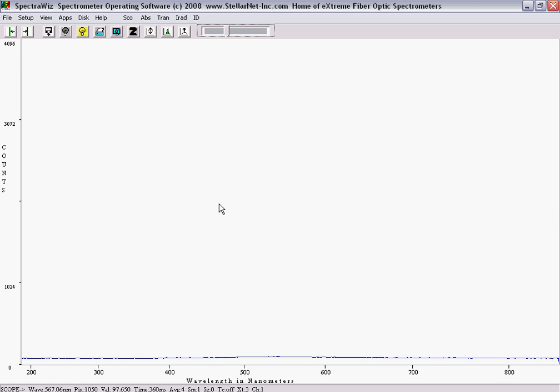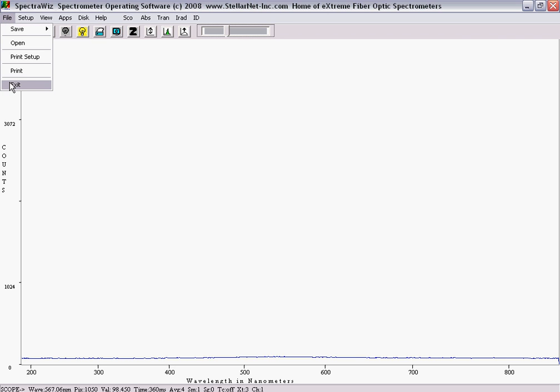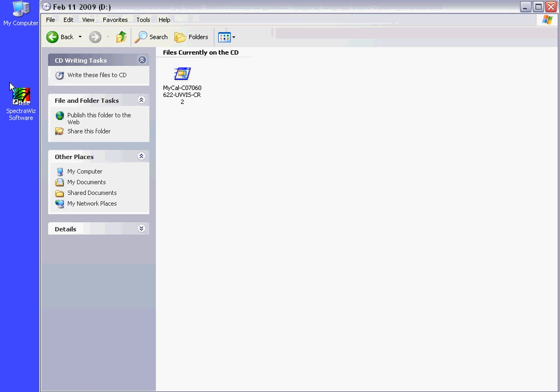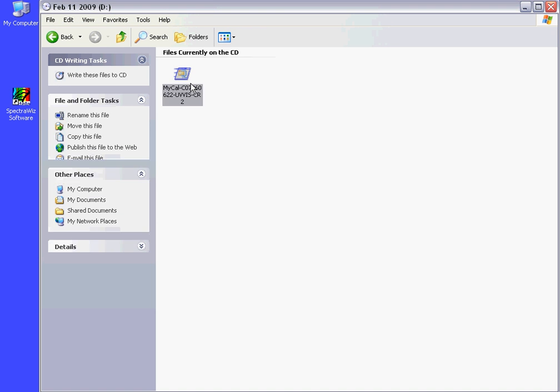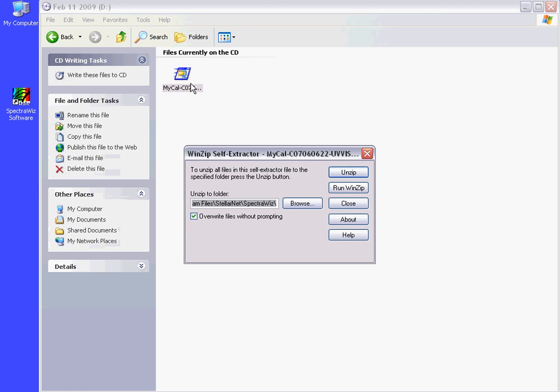For use of the Spectroradiometer, the calibration file must be installed from the supplied disk. With the SpectraWiz program closed, double-click on the MyCal executable file found on the CD.